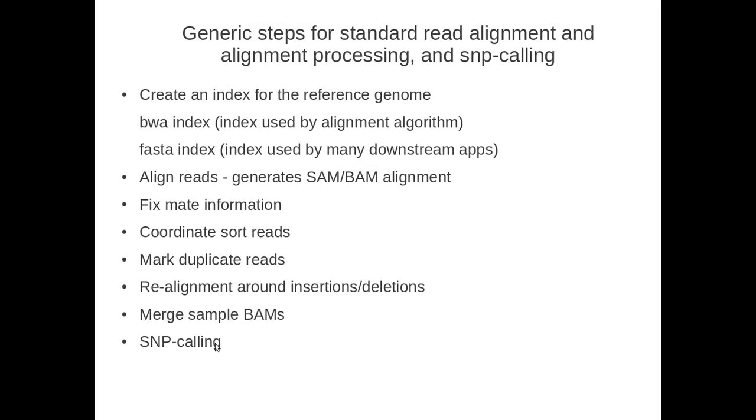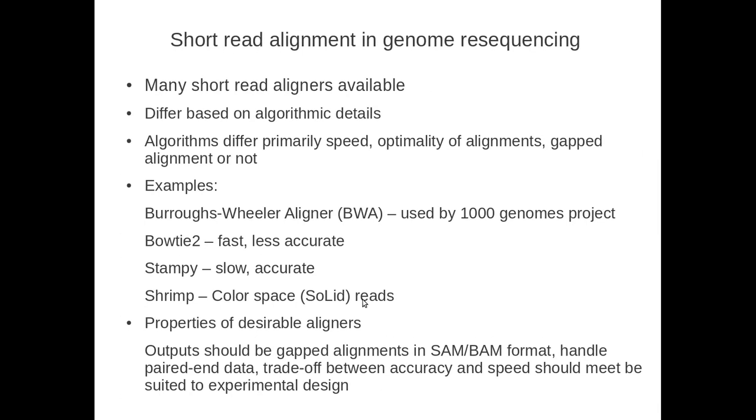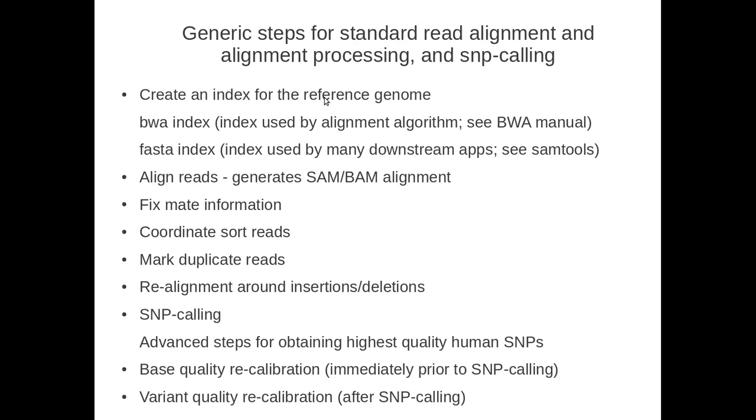And then finally we'll talk about the SNP calling protocols themselves. There's also a couple of advanced steps. We probably will revisit this briefly next week.